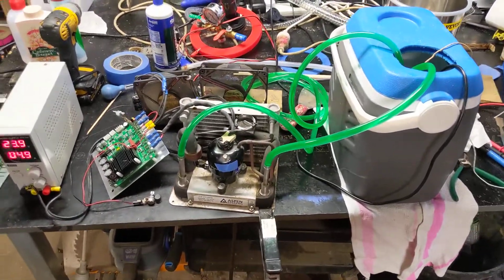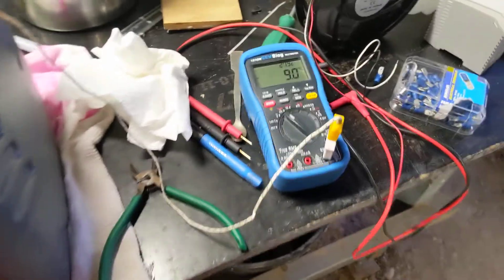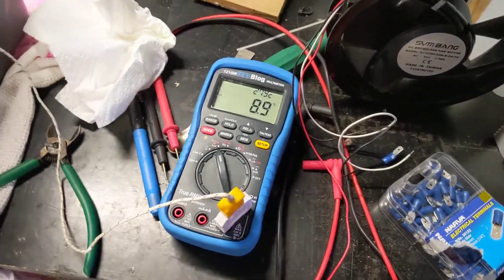This all looks to be working pretty well. It's been running for about half an hour now, started at 30 degrees and it's now down to 8.8.